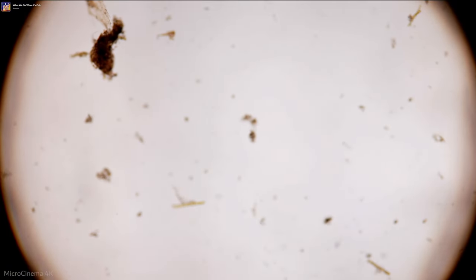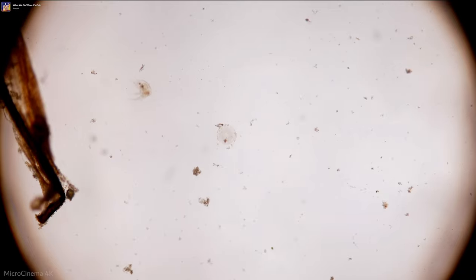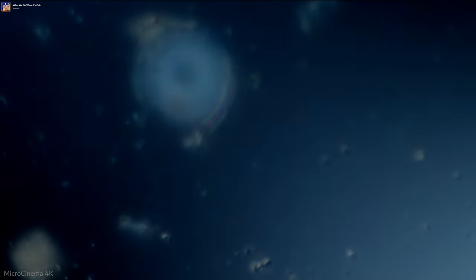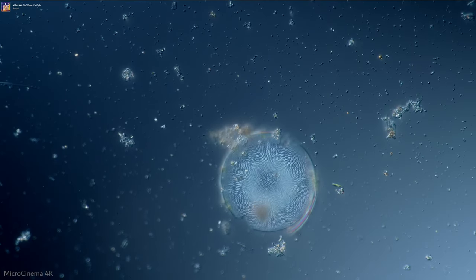what is that, actually? Why is this showing up? That shouldn't show up. There we go. Okay. Oh, yeah, and then there was this thing. That's right. One more thing to check out on this slide. Yeah, okay, I picked this up. I wasn't sure. Now I can see what it is. Yes. Oh, what a beautiful Coscinodiscus.